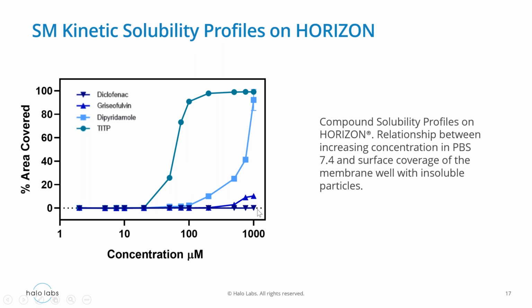In contrast, this compound, diclofenac, was soluble at all concentrations tested, even at 1 millimolar concentration. So this is very useful. This was done in a matter of minutes, and it already gives you a kinetic solubility profile for your molecules. That is something that is very important.